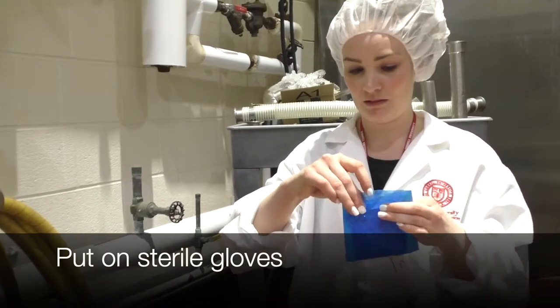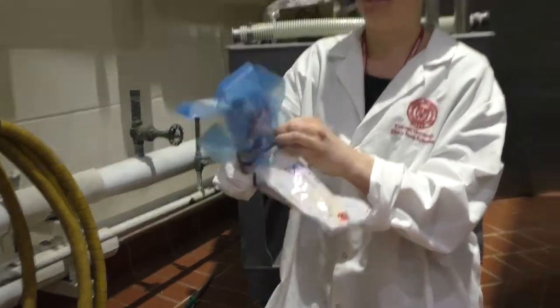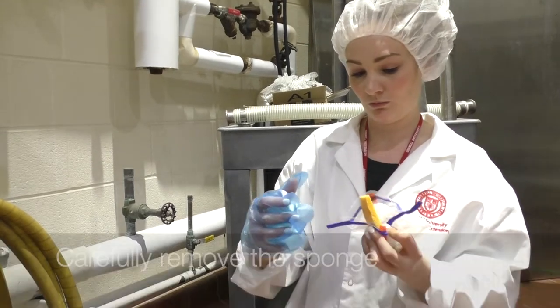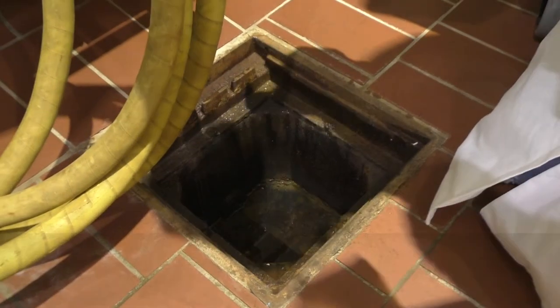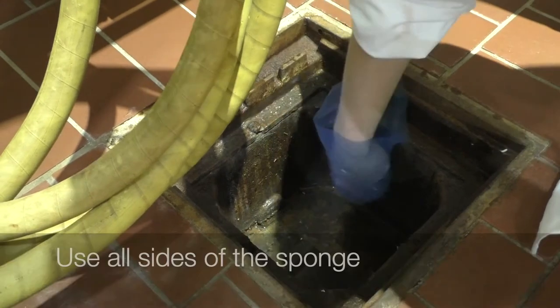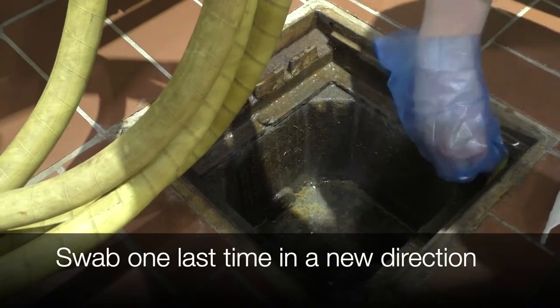Put on sterile gloves. Remember, do not touch the sponge or the inside of the bag with bare skin — always use a gloved hand. Use a fresh sterile glove for each sponge. Push the sponge to extend it from the bag and carefully remove the sponge. Aseptically swab across the entire sampling surface, making sure to apply sufficient pressure. Be sure to use all sides of the sponge, including the narrow side. Turn the sponge over and sample the same site one last time, swabbing in a new direction.